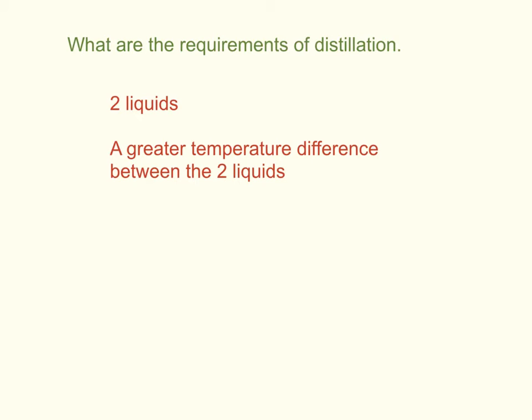And there must be a greater temperature difference between the 2 liquids of about 30 degrees Celsius. Anything closer, you cannot do simple distillation because you'll be evaporating out both of the liquids pretty evenly. You can use fractional distillation, but it won't be as easy, and there is still a limit to the temperature difference between the 2 liquids.